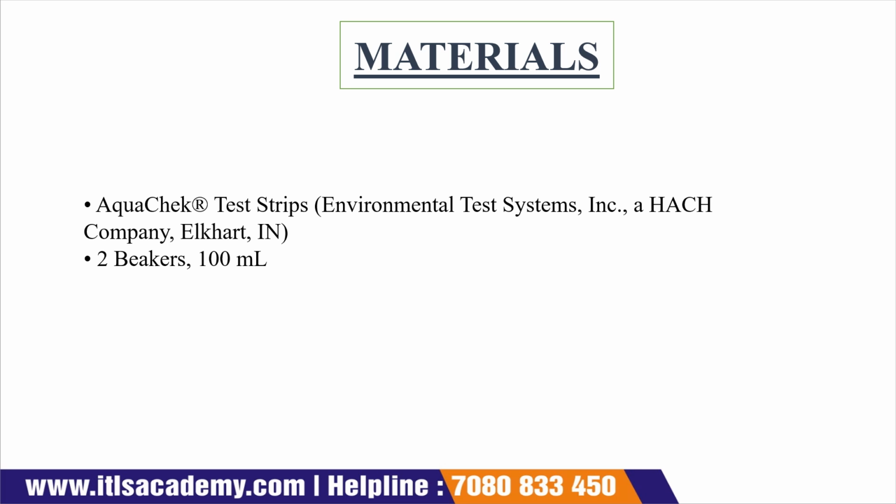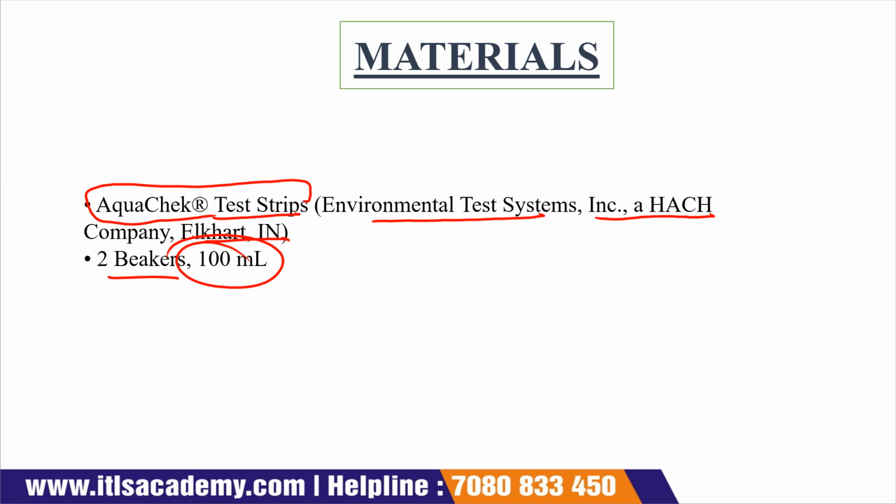Now the materials that we require for this experiment are an Aquacheck test strip. This is the test strip name, that is your Aquacheck, Environmental Test Systems Inc, a Hach company, Elkhart, IN. This is the name of the company who manufacture this strip. And we also require 2 beakers of 100 mls.